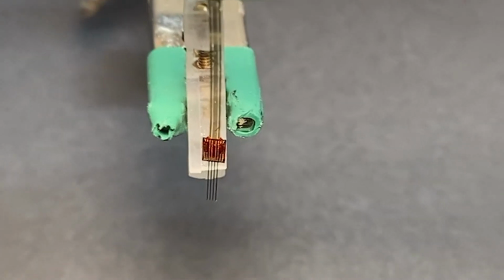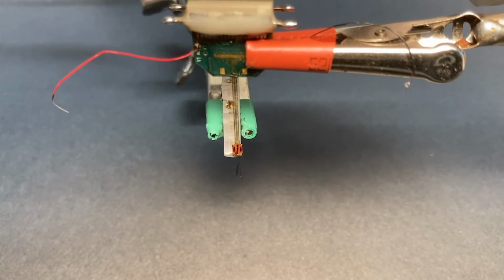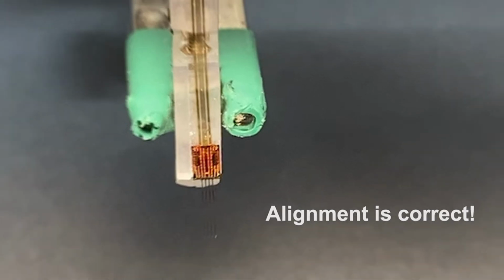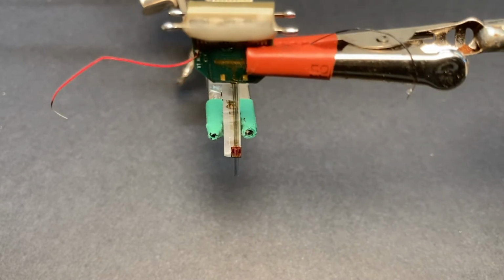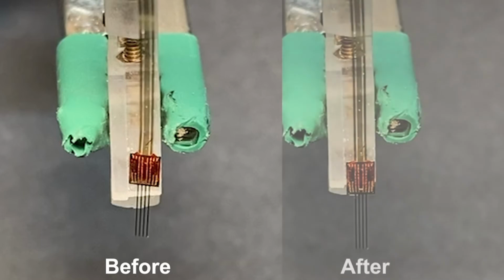And if the alignment is not correct, then you can move around the helping hand until you see a perfect alignment between your probe backend. As you can see here, it's perfectly aligned with the base of the arm. And once this is done, I highly recommend to move away your probe and then try it again, because sometimes the helping hand can just move a little bit, so the alignment is not correct. But if you confirm that this alignment is still correct, so here you can see before the misaligned version and after the perfectly aligned version.